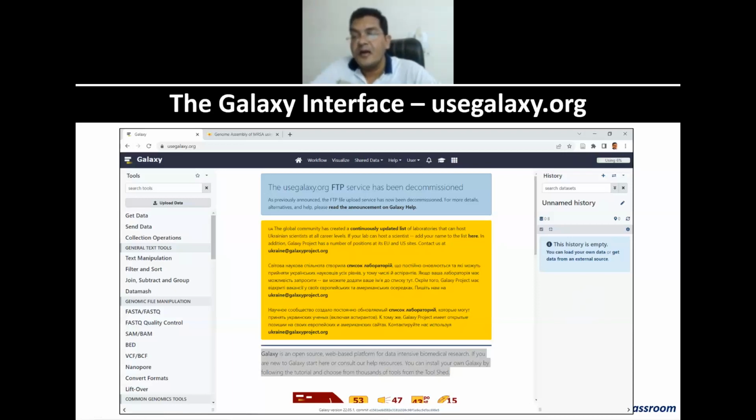If it is showing in gray, it means it is queued. If it is showing in orange, it means it is being processed. If it is showing green, it means that the process is done and has been correctly done. If it is in pink color, then it means some error has happened because of the way you have input your data. That color coding you will be able to see when you move on, right?